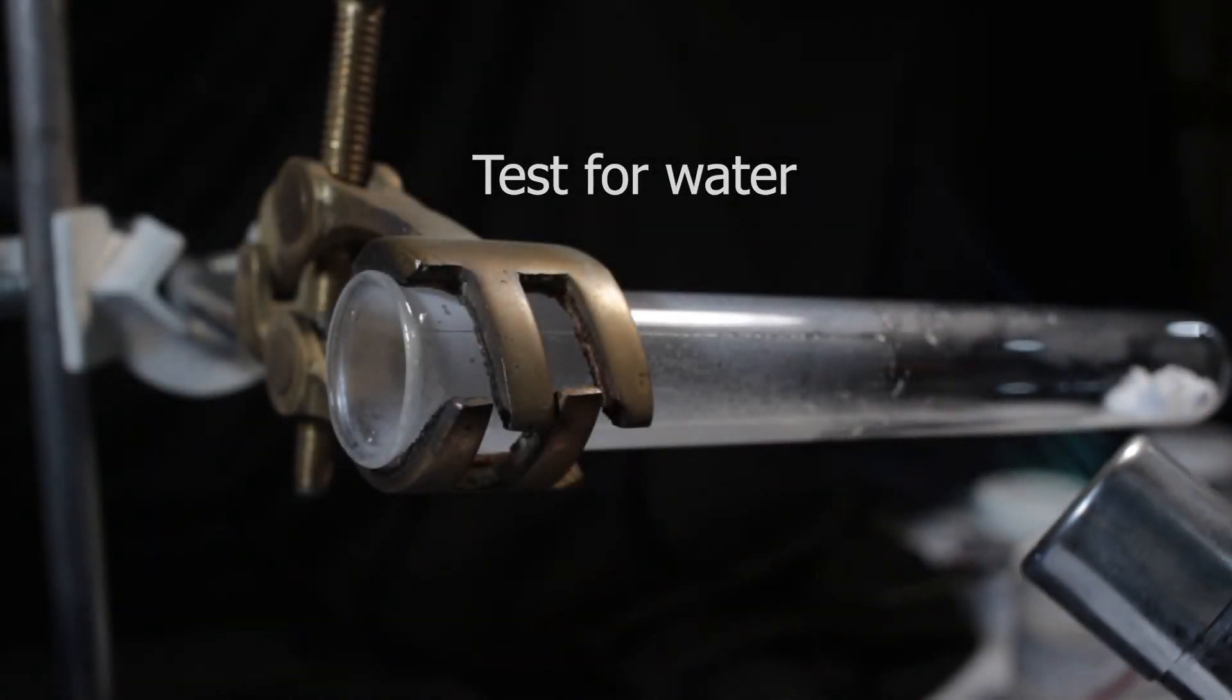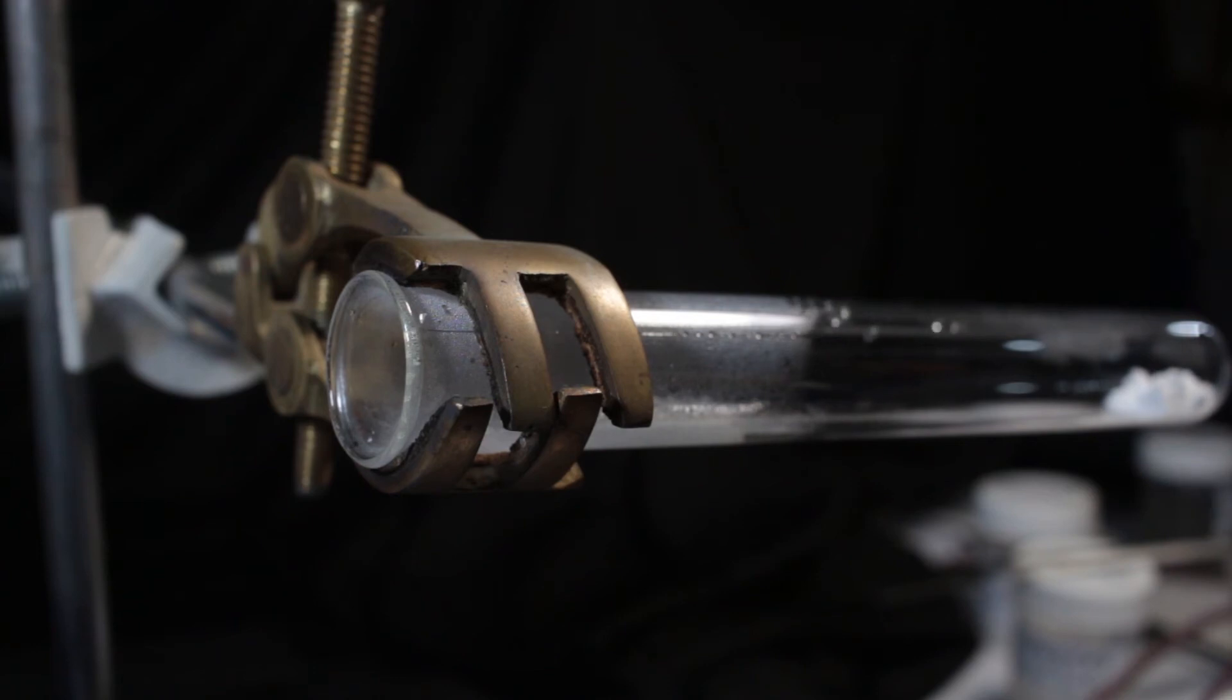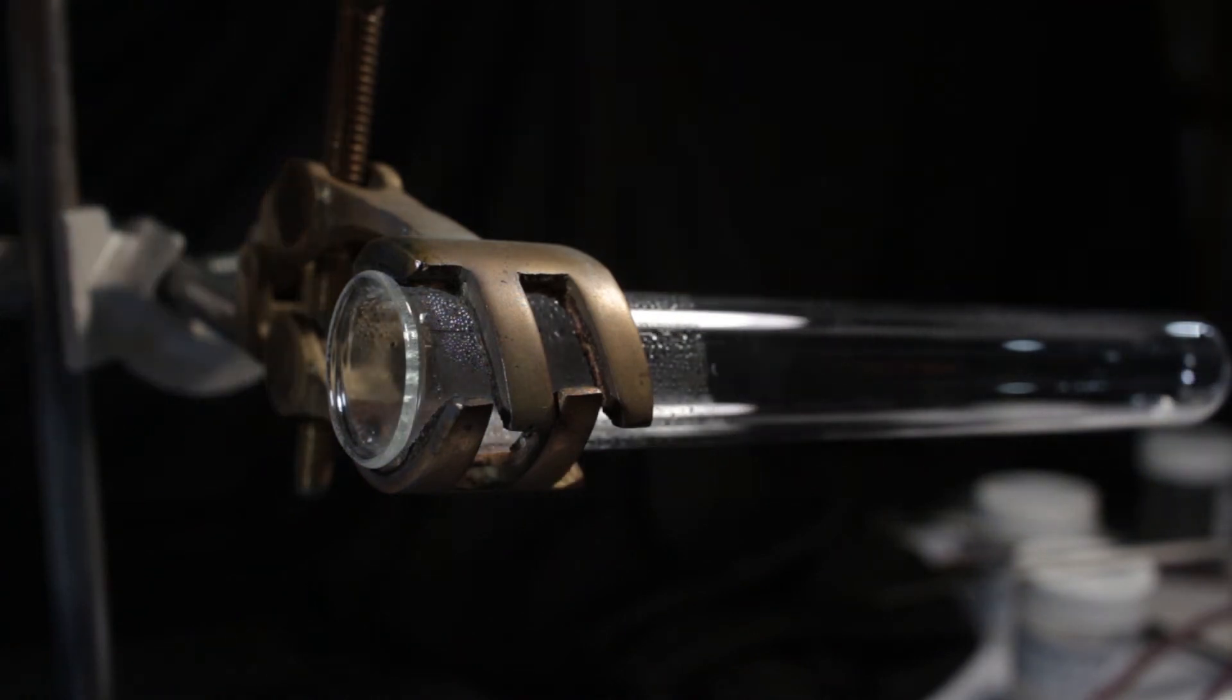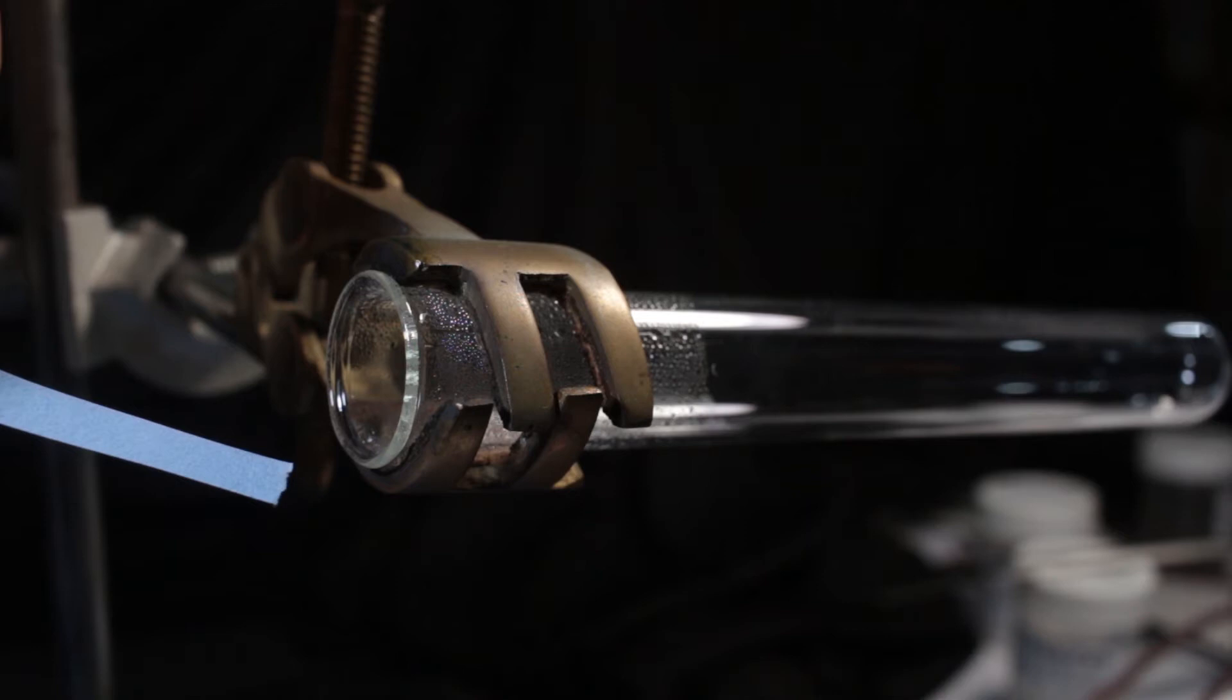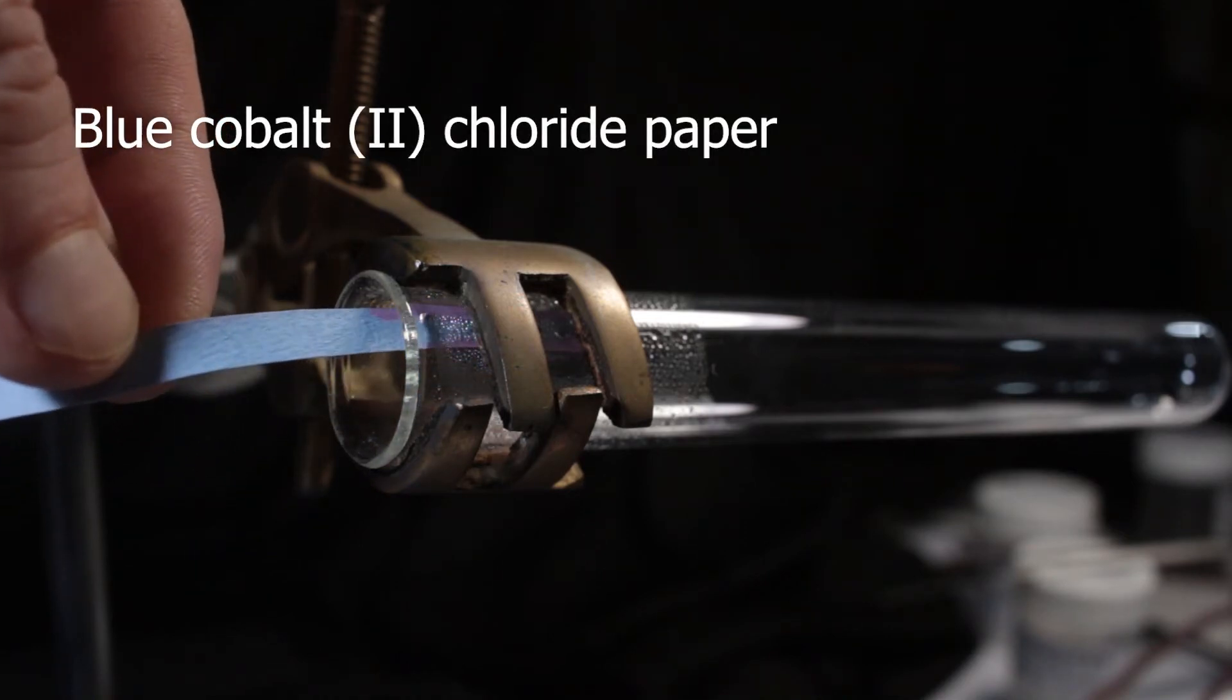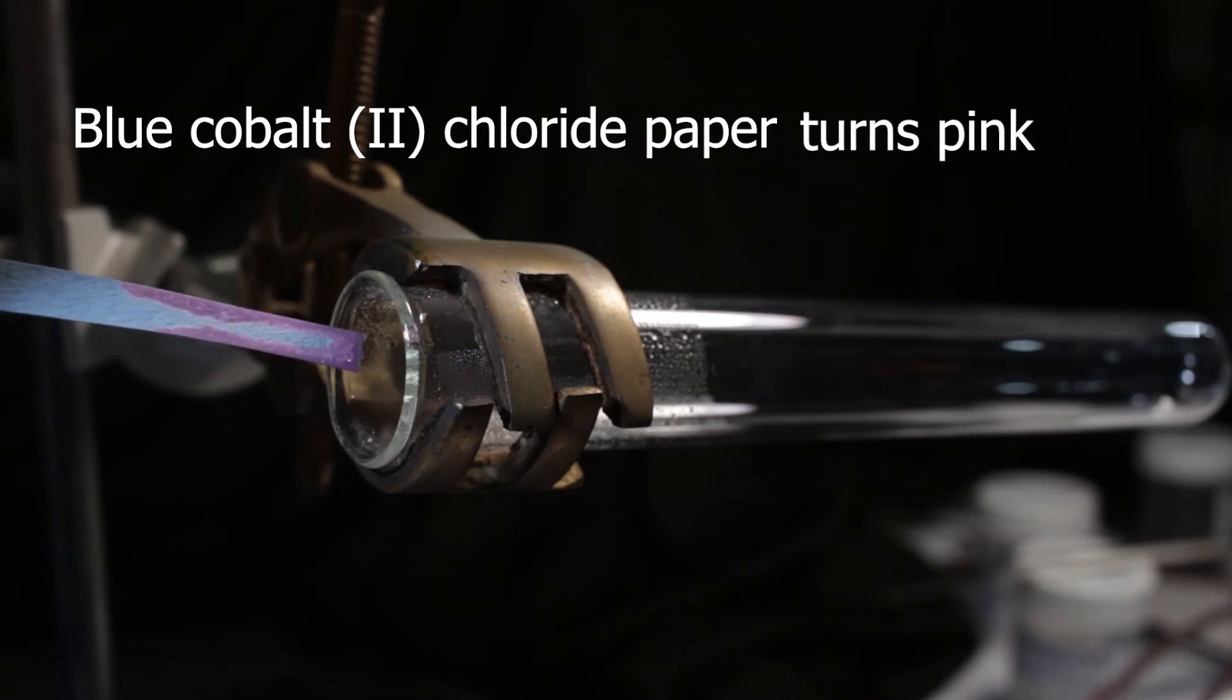Now it's turn for water. Let's drive this white liquid closer to the colder opening and test it with cobalt chloride paper. It's blue when it's anhydrous. As soon as water gets on it, it turns pink. Yes, presence of water is confirmed.